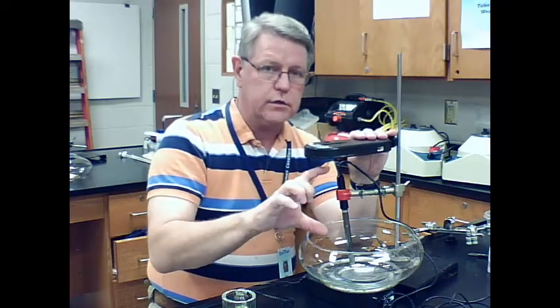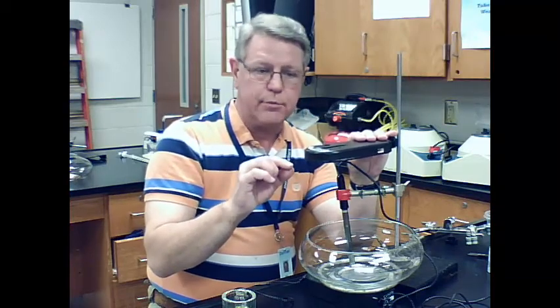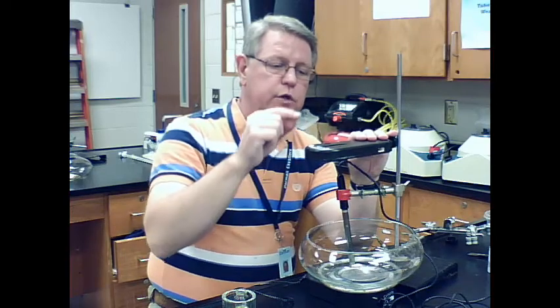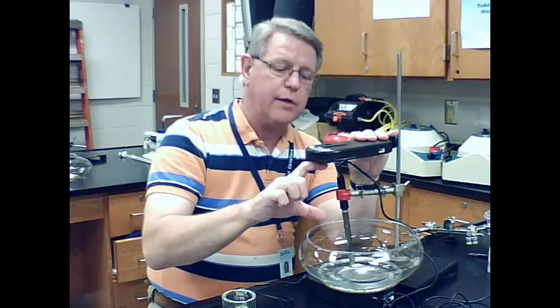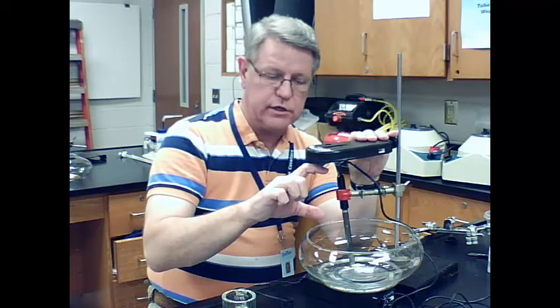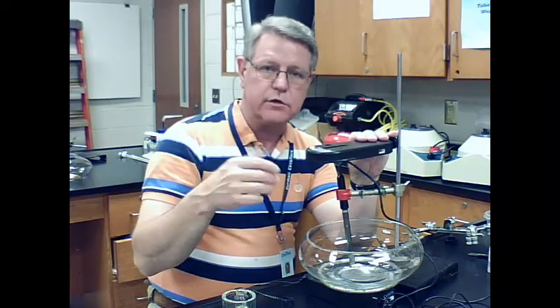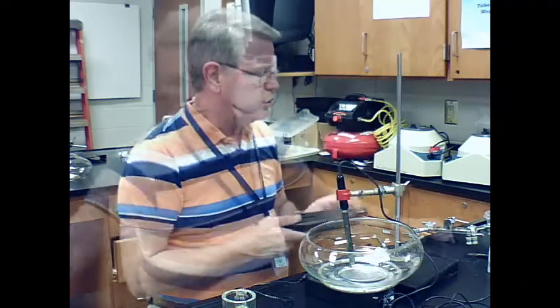in the reservoir. And you put a 10-milliliter graduated cylinder underneath. You have the computer calibrate for the number of drops. And what you're going to do is, you're going to have it start counting drops in the calibration system, start counting drops until you fill, say, about 9 milliliters of that graduated cylinder. And then you're just going to calibrate it for that 9 milliliters. And what happens is, the computer automatically figures out what volume each drop, on average, has, and that's how you use the drop counter.